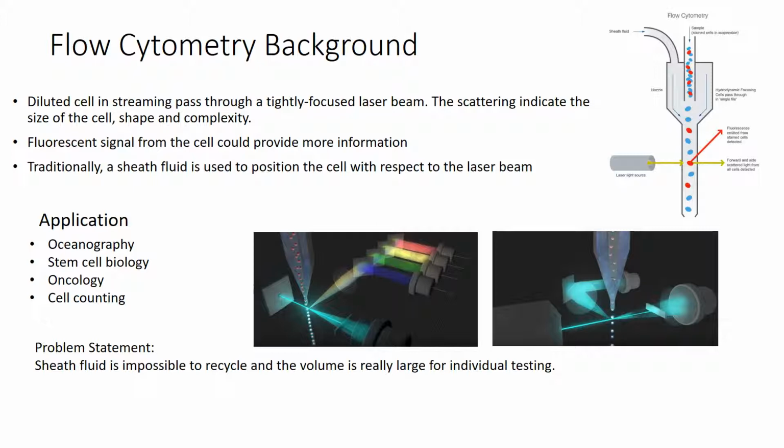particles. Traditionally, a sample containing numerous cells or particles is first suspended in a fluid and injected into the flow cytometry instrument. The sample is focused to ideally flow one cell at a time through a laser beam, and the light scattered is characteristic to the cells and their components.